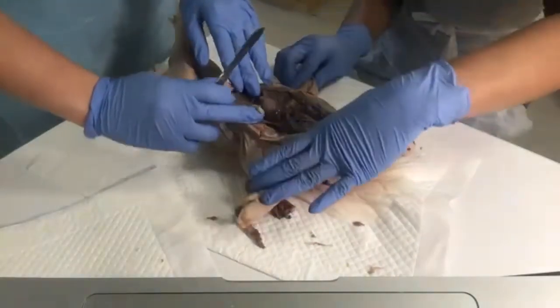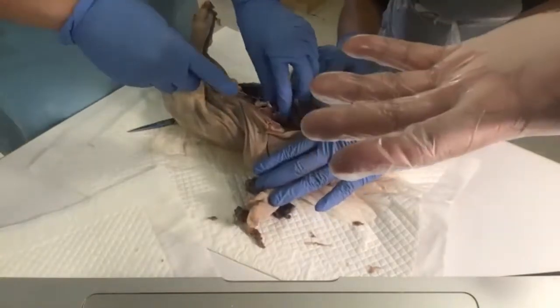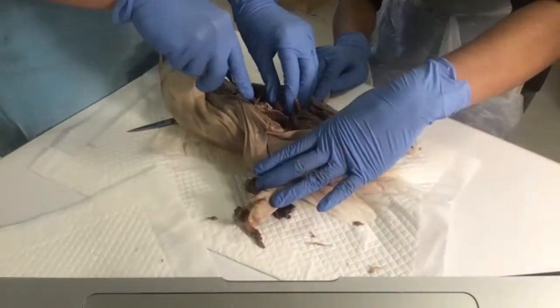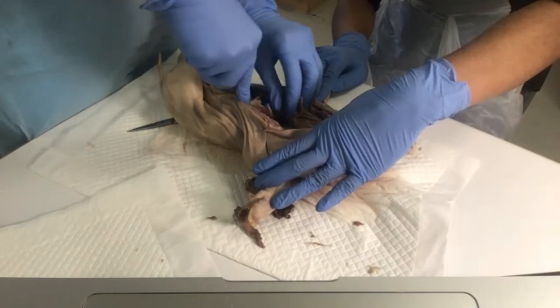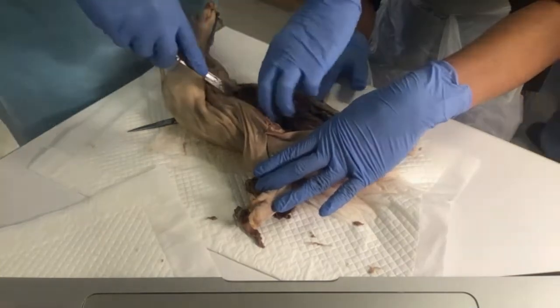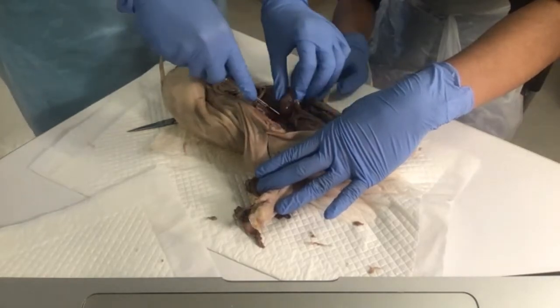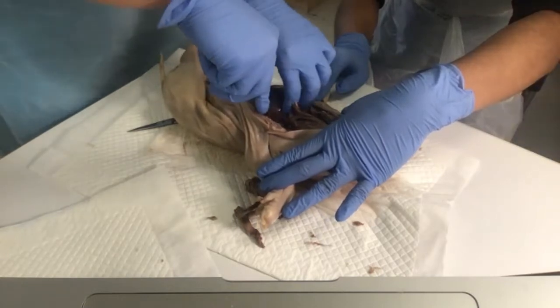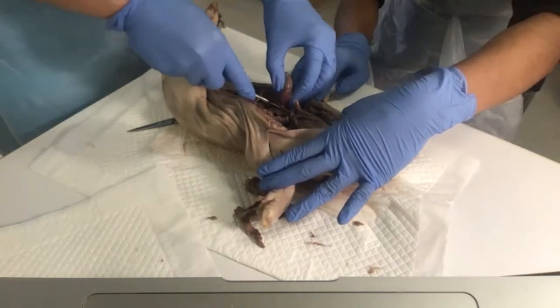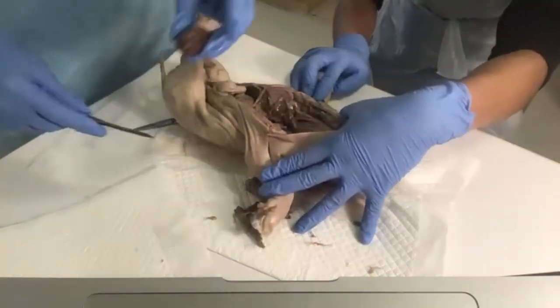Now, do you see when your gloves, especially the vinyl, they start looking like this? They start getting clear. And you can kind of feel like your fingers are starting to get moist. Glove out, switch out. And if you have to go through 4 or 5 sets, you have to go through 4 or 5 sets. It needs to get done. And you can see, look, my hands are cracking because I've been having labs for the last 3 weeks.